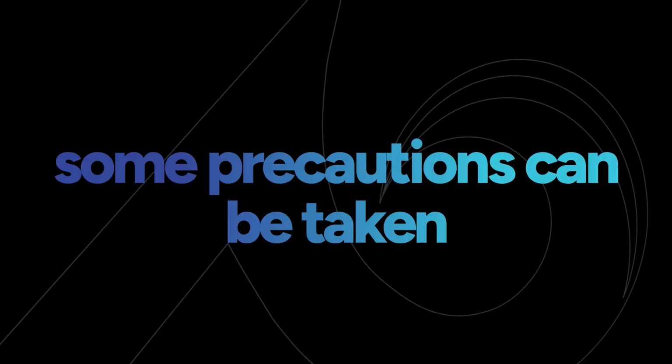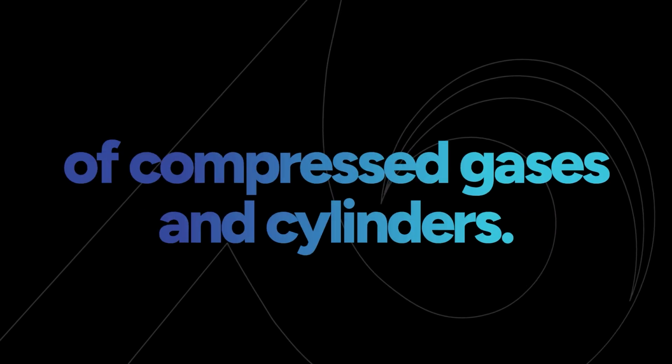Luckily, some precautions can be taken to ensure the safe use and handling of compressed gases and cylinders.